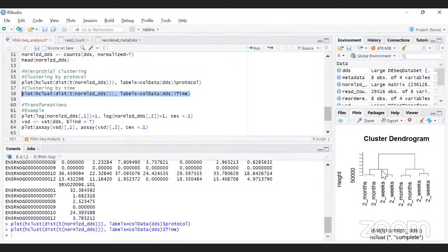So the idea is that this EDA is very intuitive. This is something you would normally expect as well. When you're doing an RNA-seq with different conditions, these cells will capture the different conditions, as well as how long this particular treatment has been done to them. It gives us added validation that the samples are the correct samples as well, that there's no intermixing or cross contamination or anything like that.